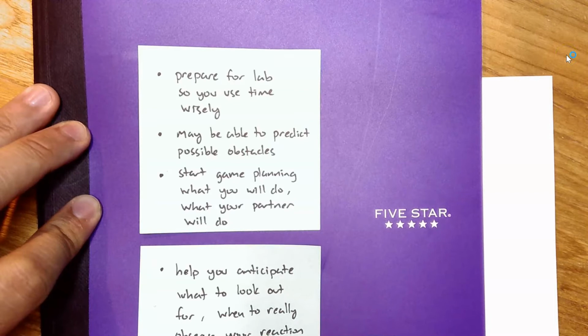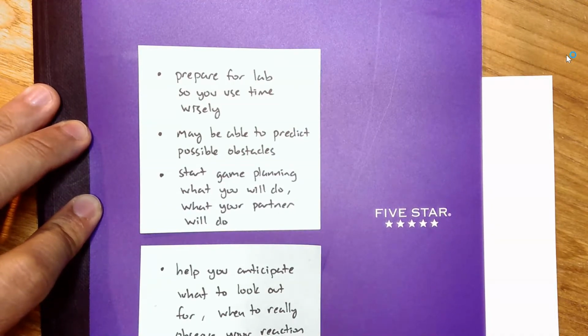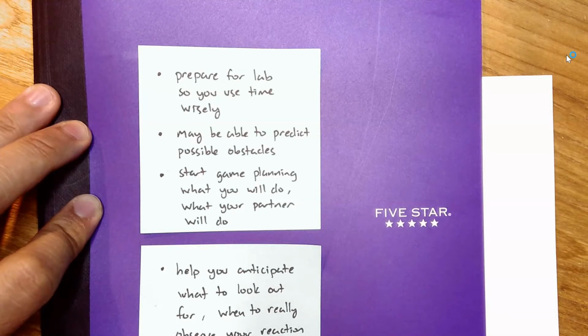Why do I want my students to write a pre-lab entry? It helps them prepare for lab, so they use their time wisely. As they're writing their pre-lab entry in their notebook, they may be able to predict possible obstacles. For instance, when will the balances be very occupied? Or when can they possibly use the hood, for instance, for a reaction or a step that produces a lot of fumes.